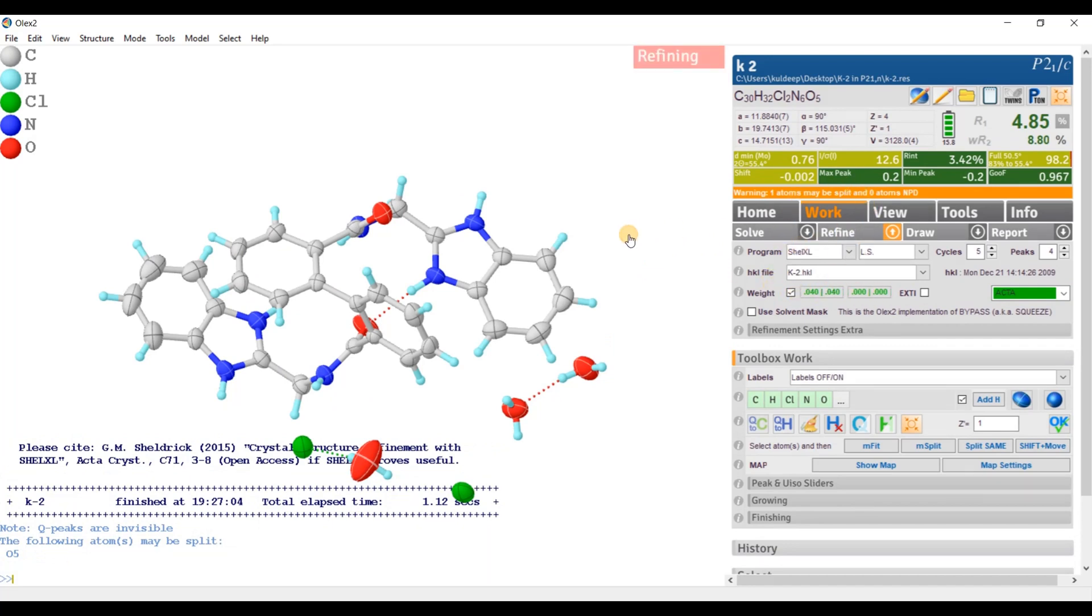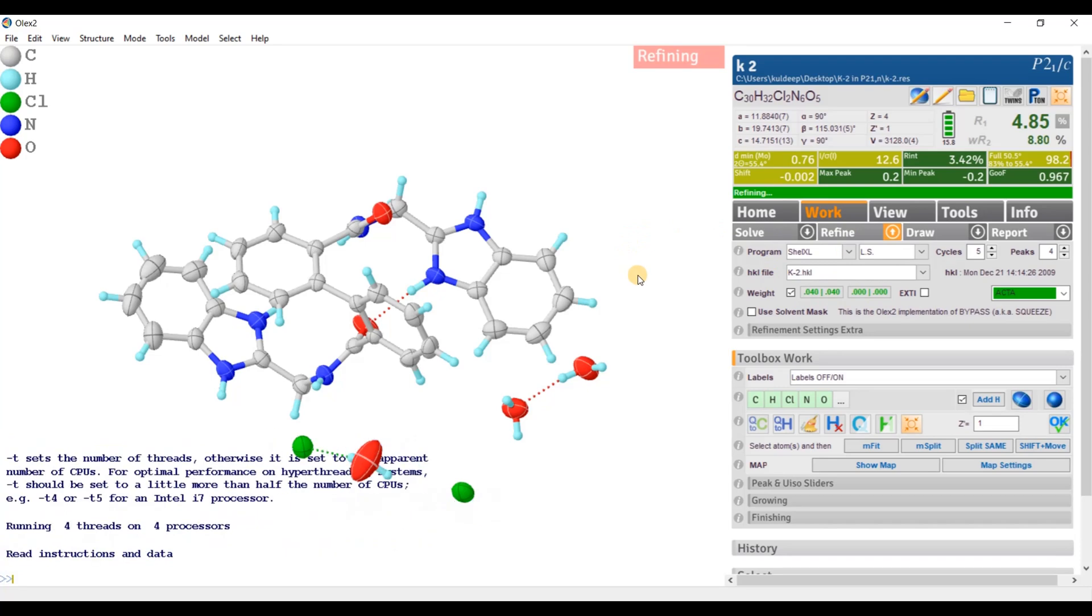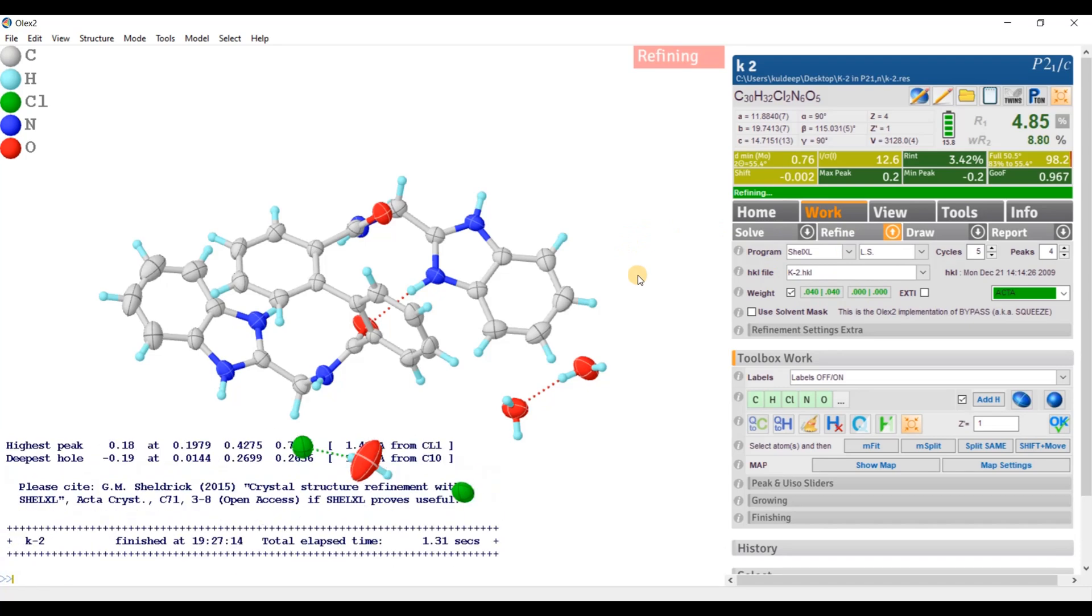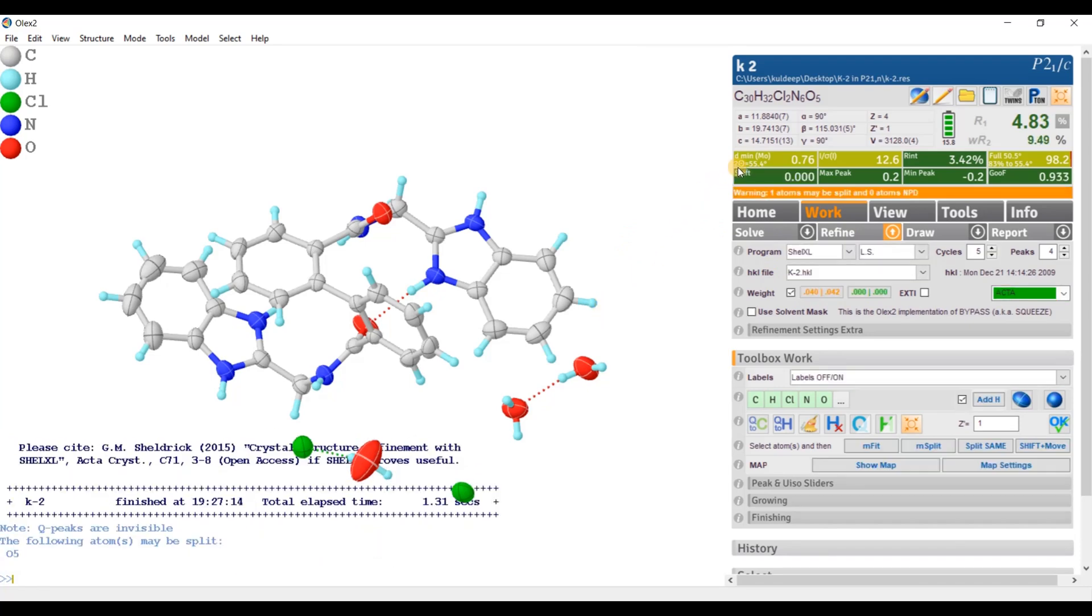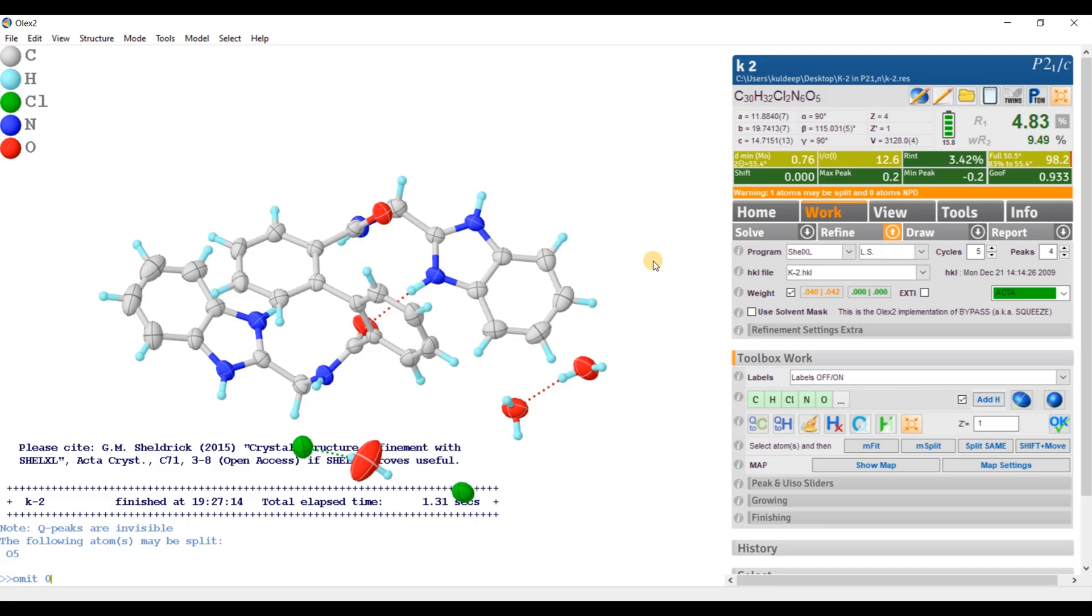Refine. Here the resolution is around 0.76 angstroms. So we need only resolution up to 2 theta 50 degrees. So I am going to omit 0 50 and refine one more time.